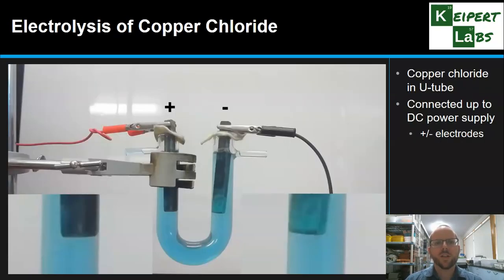So we're going to show you here a time-lapse video that shows what happens when we pass an electric current through a solution of copper chloride. So we've got this blue solution in the YouTube here, we've got connected up to a power supply, positively charged electrode here, negatively charged electrode here, and then you're going to see what happens when we switch it on.